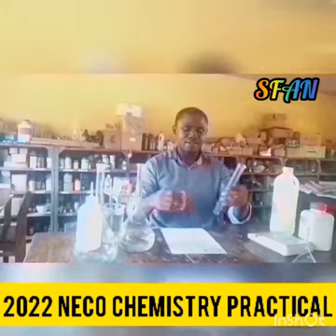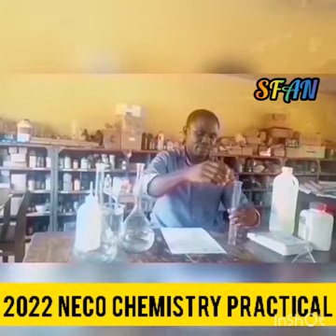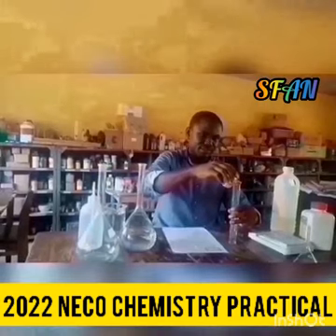So I will measure out 9.5 cm³ of this acid using this measuring cylinder.